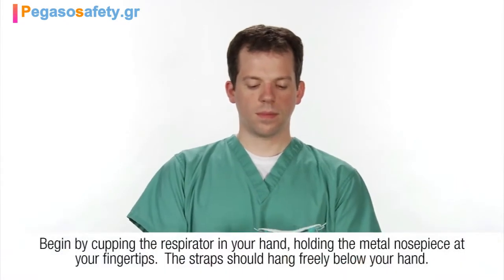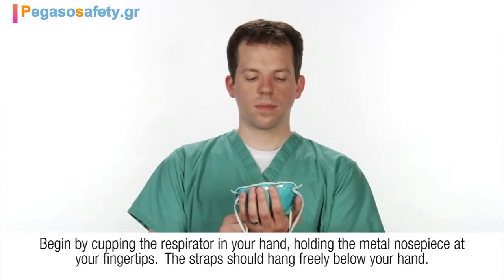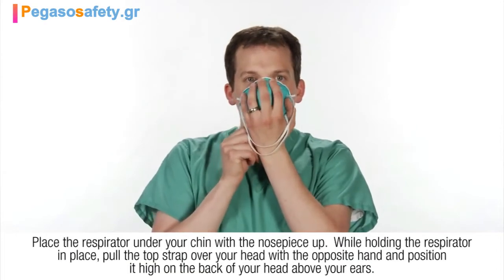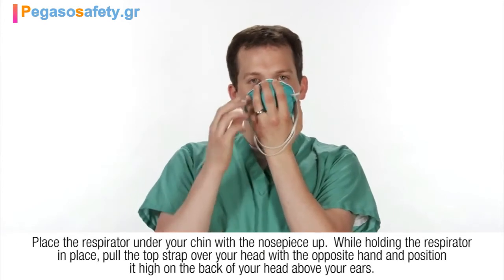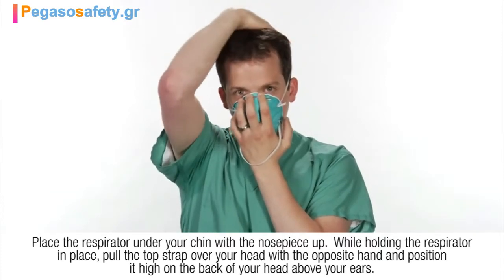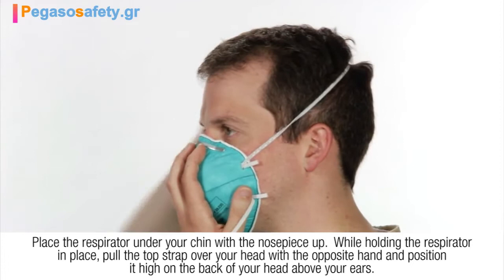Begin by cupping the respirator in your hand, holding the metal nose piece at your fingertips. The straps should hang freely below your hand. Place the respirator under your chin with the nose piece up. While holding the respirator in place, pull the top strap over your head with the opposite hand and position it high on the back of your head above your ears.